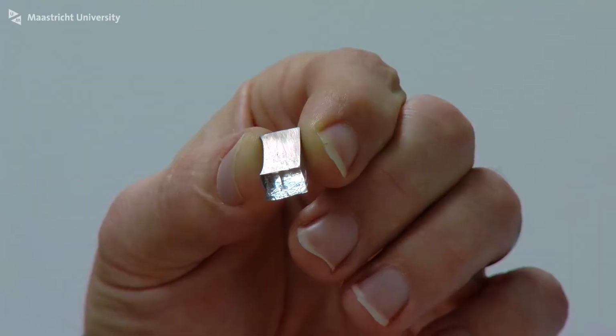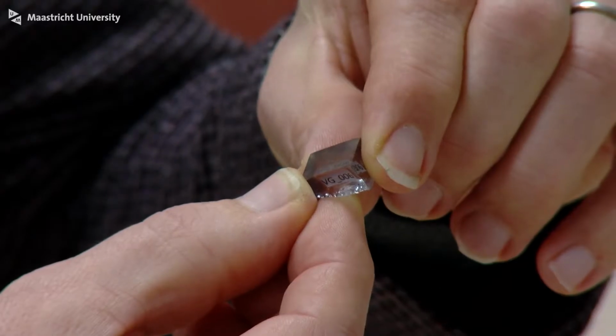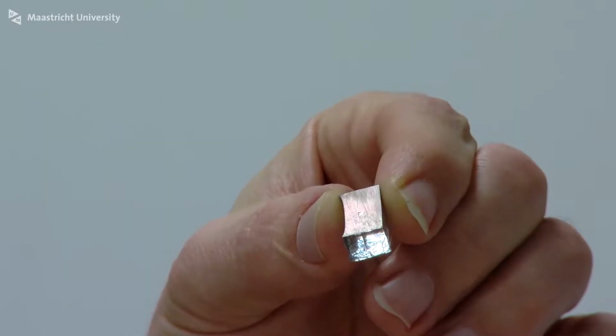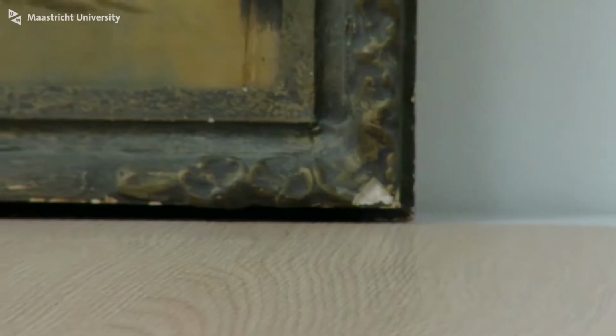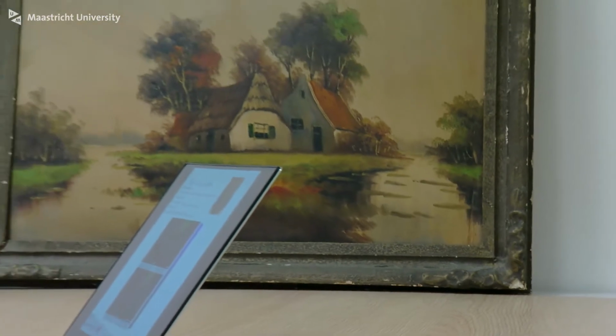We actually prepare little cross-sections like this, actually tiny flakes of the painting where we stick a knife into it, chip out a small 1 millimeter piece of paint, and we can't handle those amounts of paint, so we embed them in these resins. And these resin blocks, we actually polish them so that all the individual layers of the painting become visible. The grounding layer, the colors, the varnishes. And when we look at those with our molecular microscopes, then we can assess whether it's a true 18th century painting or maybe a modern fake.